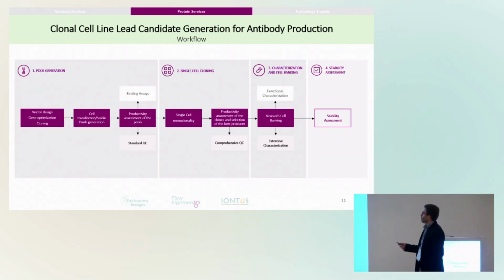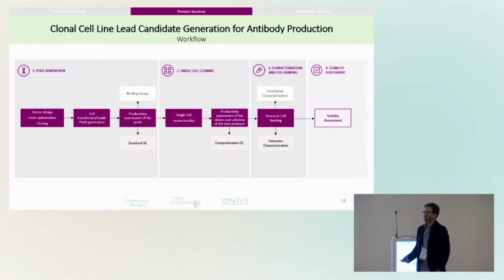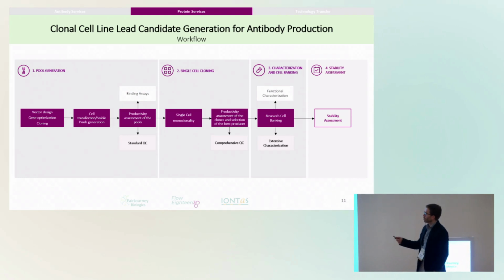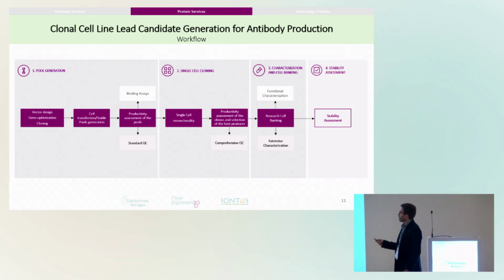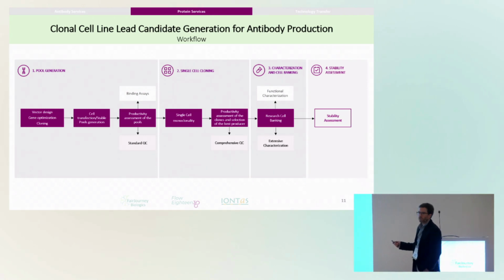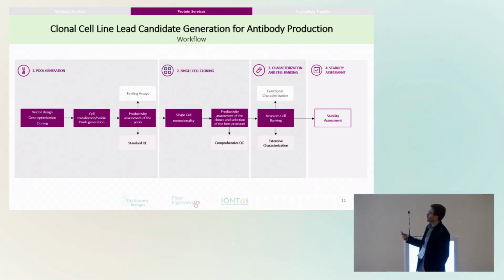So here we have an overview of the process for the ones that are not familiarized with this kind of workflow. We have 4 blocks. The first one is the pool generation. The second one, single cell cloning. The third, characterization and cell banking, and the fourth, stability assessments.